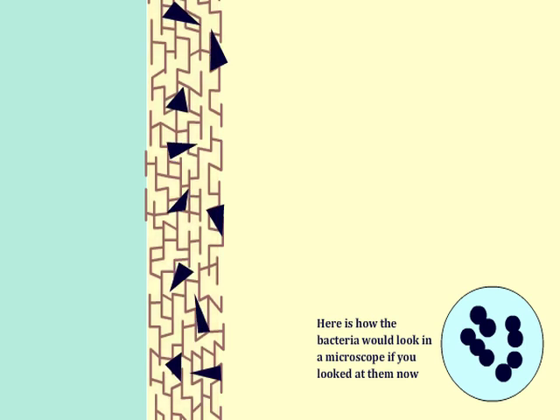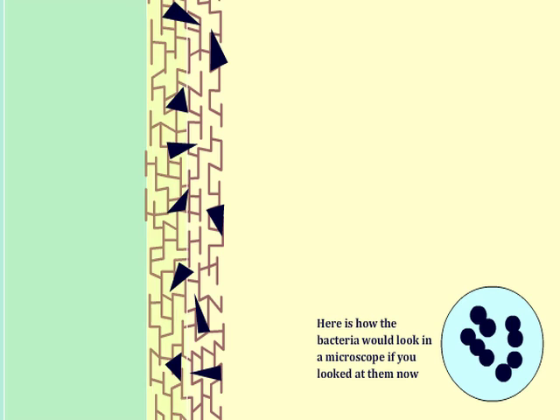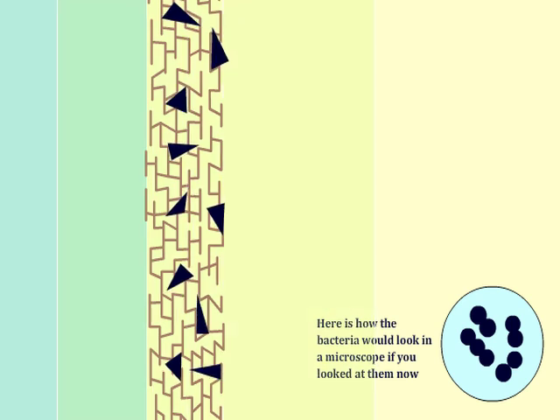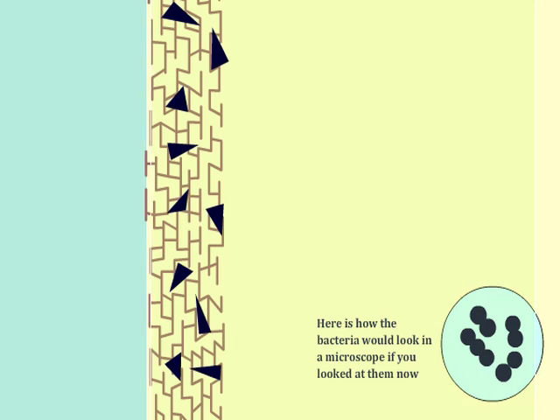The slide is now rinsed with a decolorizing agent, an acetone alcohol solution. However, the crystal violet iodine complexes are not washed out of the thick and tortuous layers of the gram-positive cell wall, and the organisms remain dark blue in color.